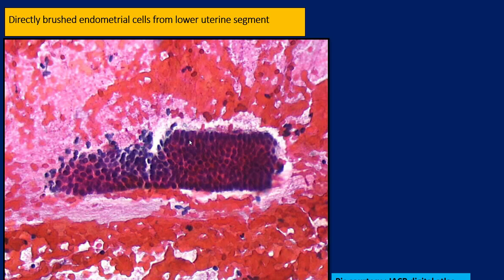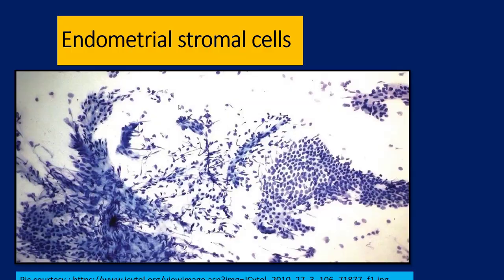At higher magnification, these directly brushed endometrial cells show palisading nuclei with extremely closely packed nuclei, but on close inspection the nuclei are rather uniform, and in areas that are less closely packed there is a monolayered pattern. Spindle-shaped stromal cells from the lower uterine segment may also be seen under these conditions.